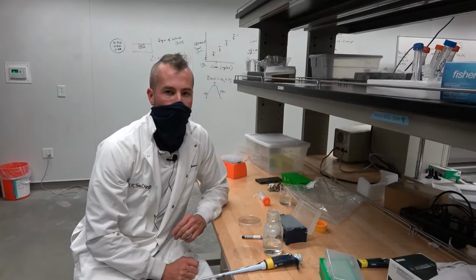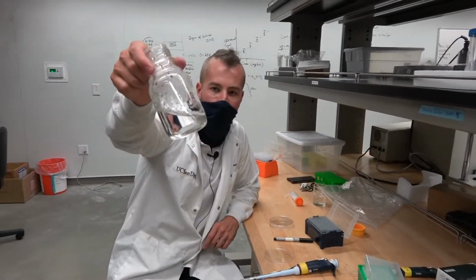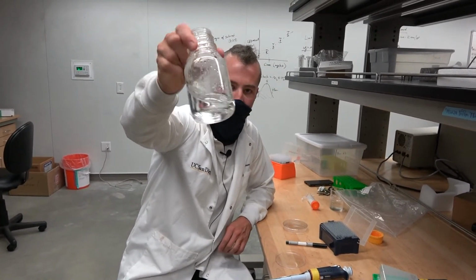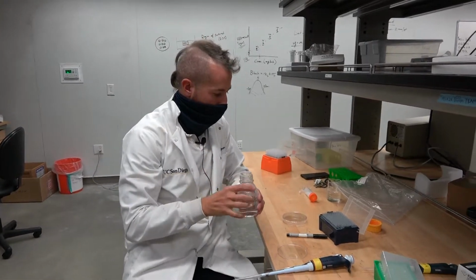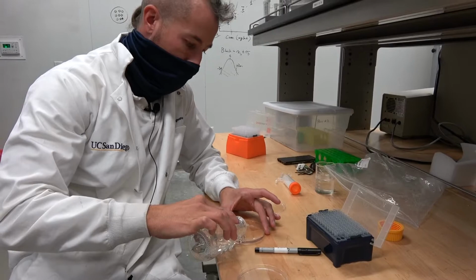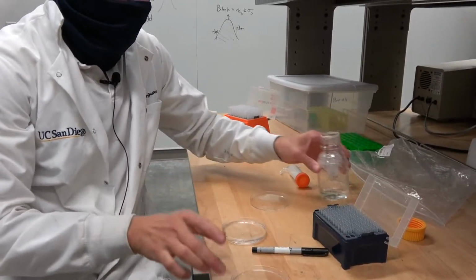Okay, so this is what it looks like after we have completely microwaved it, and you can appreciate that it's completely transparent. So what we're going to do now is just gently pour this into the plate.